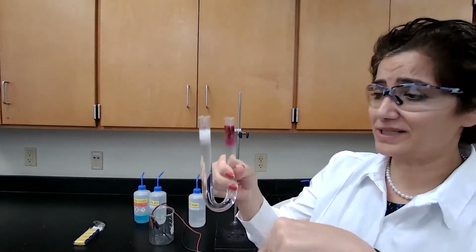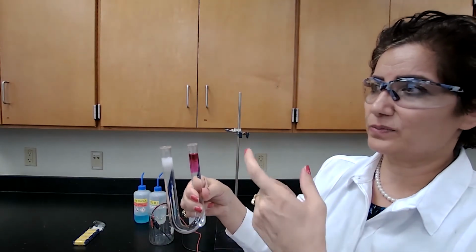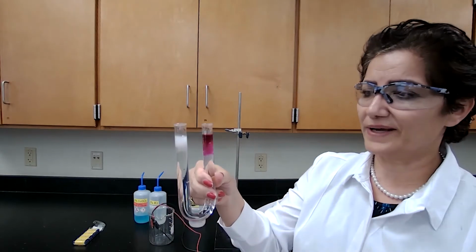I'm going to wash this tube or use a different tube to get started with the copper sulfate next.